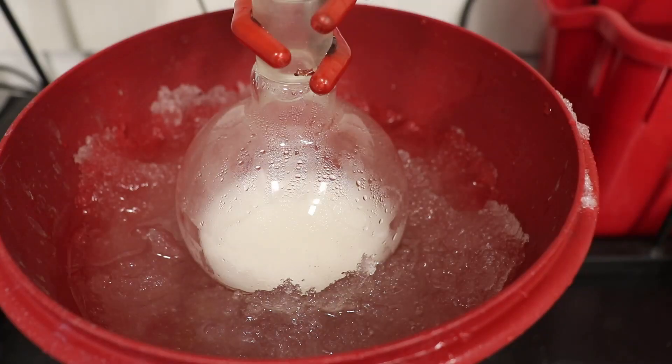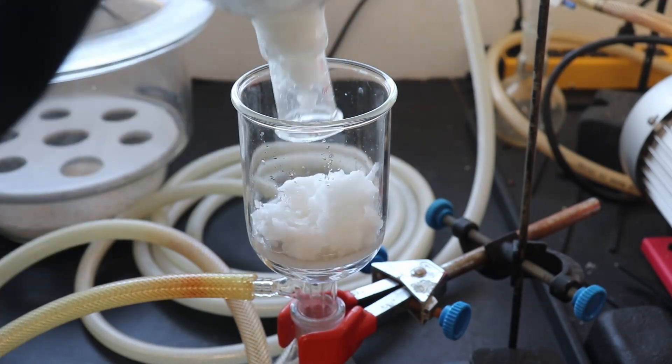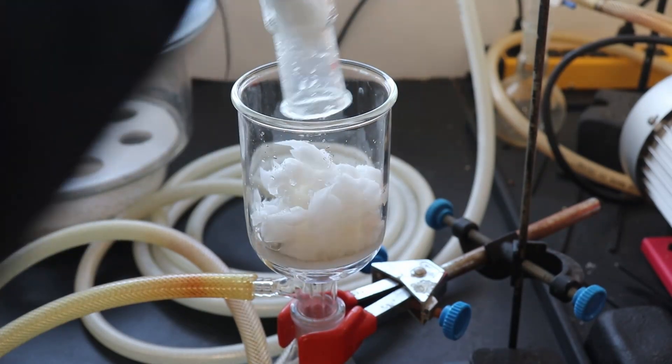The flask was then cooled on ice, broken up, and filtered off, washing with two 30ml portions of anhydrous diethyl ether.